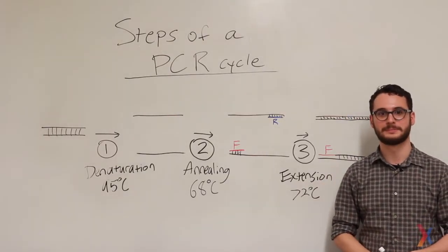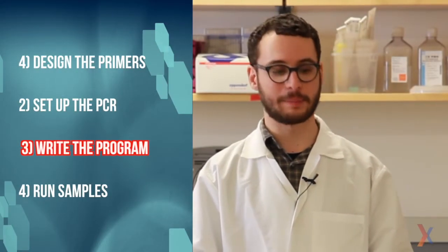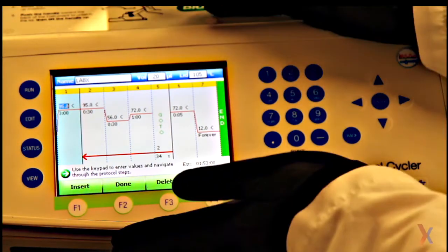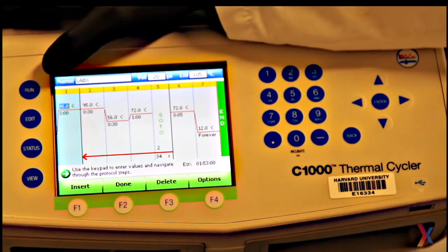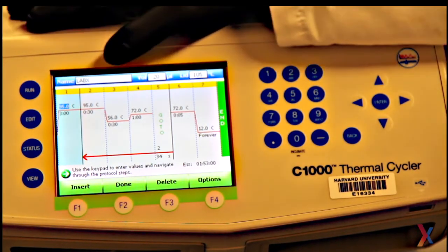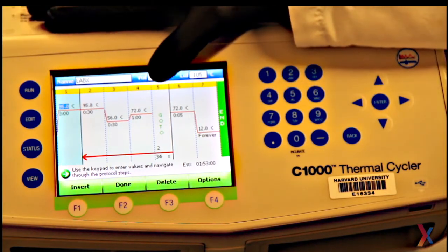Now it's time to set up the program. Next, I'll need to write a PCR program into the thermocycler before adding my samples. Here's the thermocycler screen that shows a schematic of the PCR reaction with each step from left to right. And steps two through four here will be repeated within each PCR cycle.